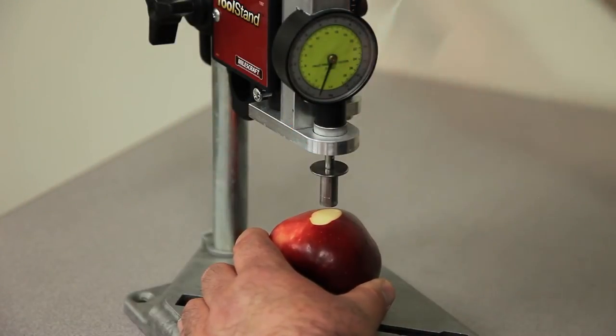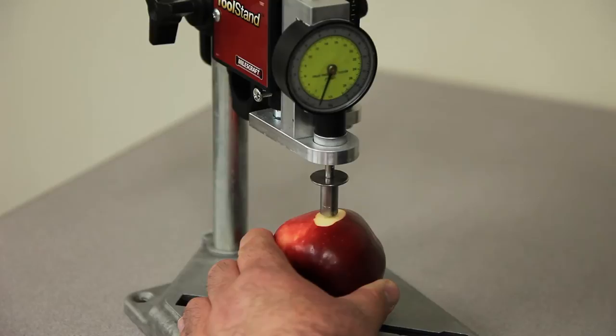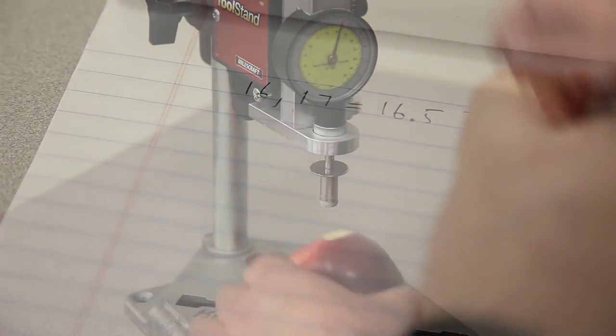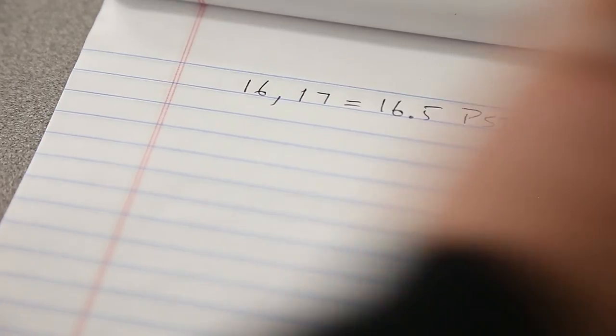Note the pressure, clear the dial by pressing the button, and repeat the procedure on the other side of the apple. Averaging the pressures from both sides of the apple will tell you the overall pressure of the fruit.